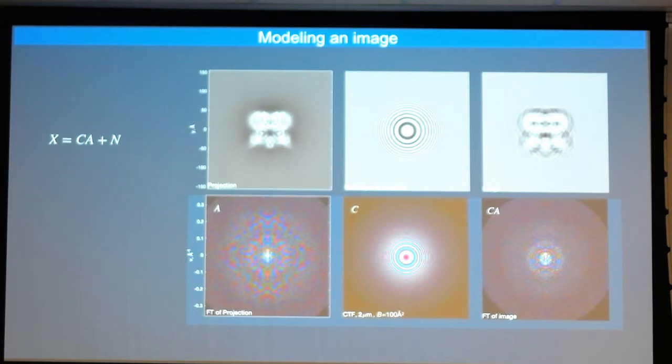fringe out here. Because the diffracted waves go off at a particular angle, the more you defocus, the more this delocalization happens, the more these fringes extend out from the image of the object, and actually, the more space you have to include in the box of your particle image to include all of those fringes, because the fringes contain your high frequency information.